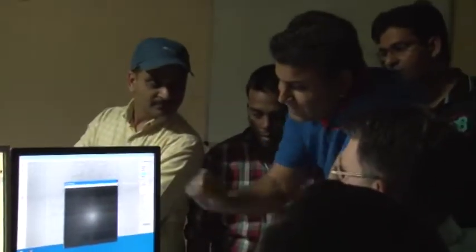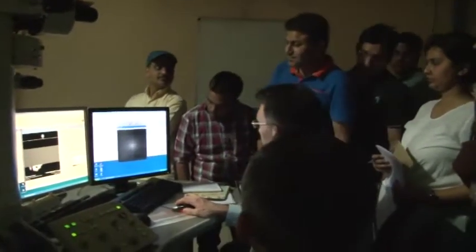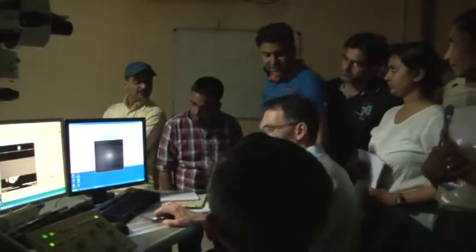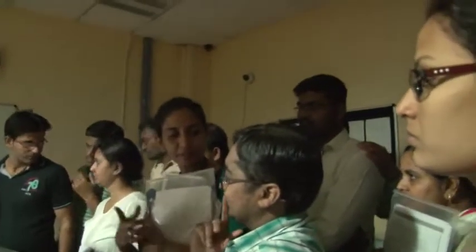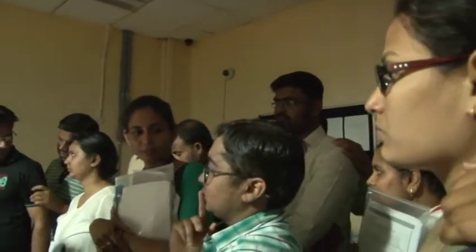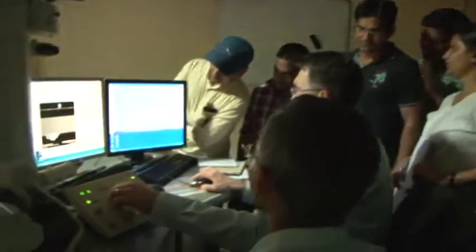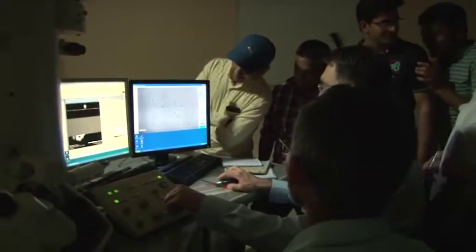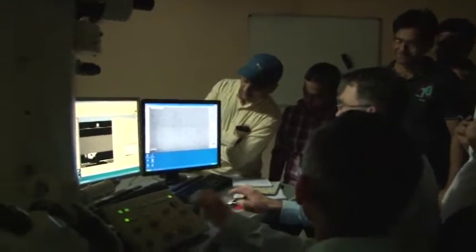We want to do FFT, live FFT, just to see the light. Actually, in this camera there is a problem. Only one thing can run: either you will see FFT or the image. In the other software, you can do it simultaneously. Okay, then let's just demonstrate that.